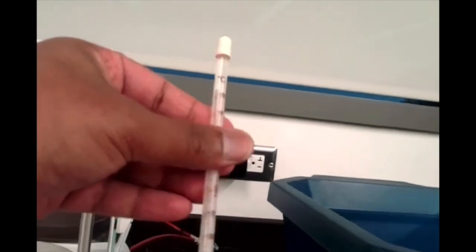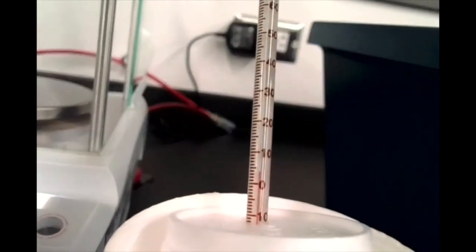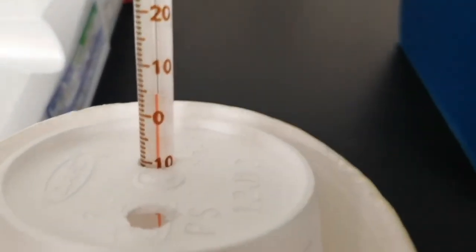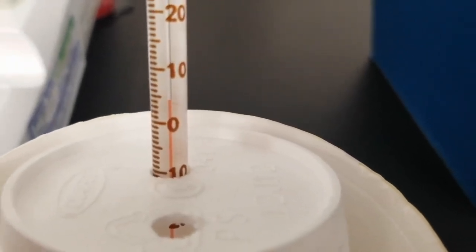So let's make a note of that final temperature on our thermometer. I'll take a close up with my phone here and get a nice good temperature reading on that. So let's make a note of that final temperature.